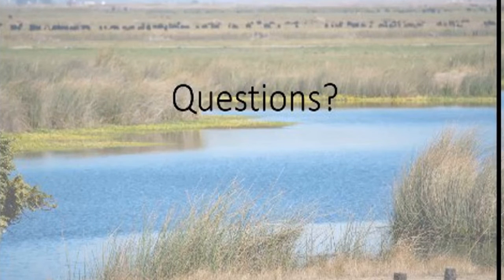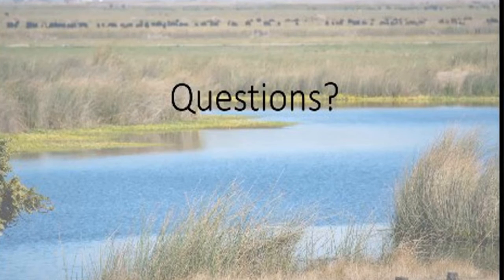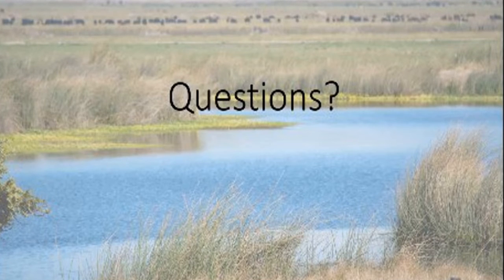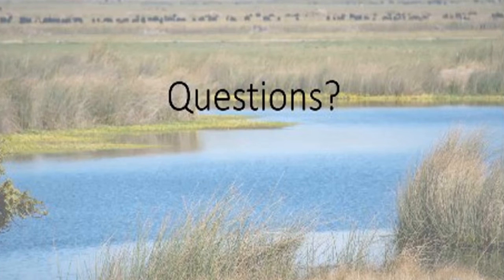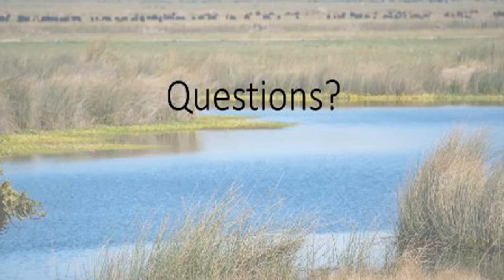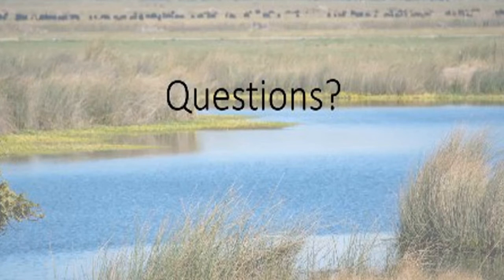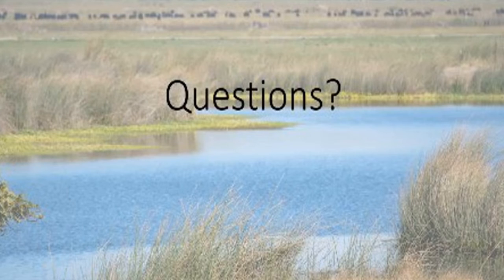And then I think the goal with Sherlock and with eRNA is the thought that it could be conducted out in the field. We have this Axon machine that can be run on a battery, and we can run Sherlock reactions right out there. It would take an hour or maybe 2 at most. And so I think that would probably be one of the best ways to try to move forward with this eRNA in the field.